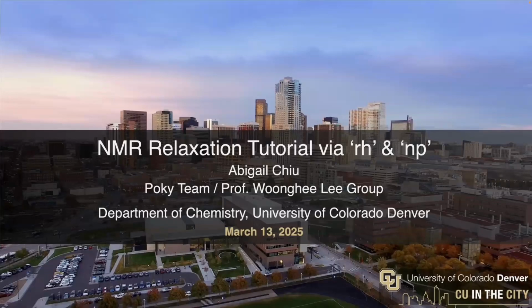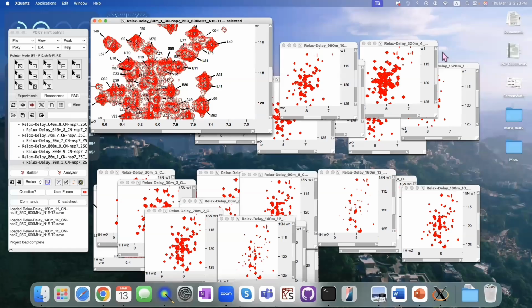Hi, my name is Abigail Chiu, and welcome to this tutorial on performing NMR relaxation via peak height analysis, or RH, and perturbation plot, NP, in the POKY suite. In this tutorial, we will go over how to use RH to fit peak heights or volumes in a series of spectra to a decaying exponential, and NP to create perturbation plot on your hetNOE data.